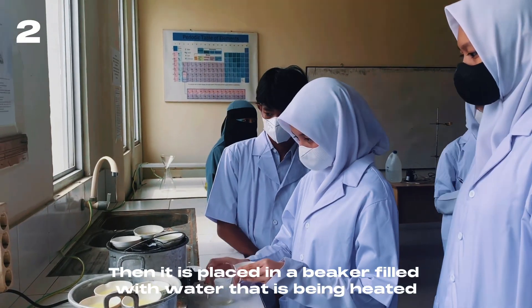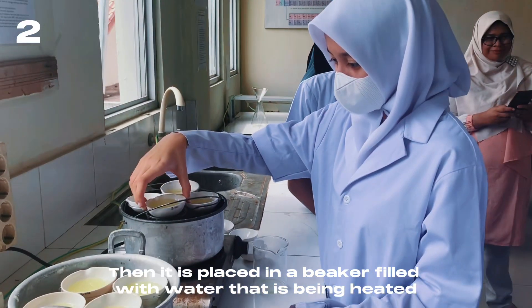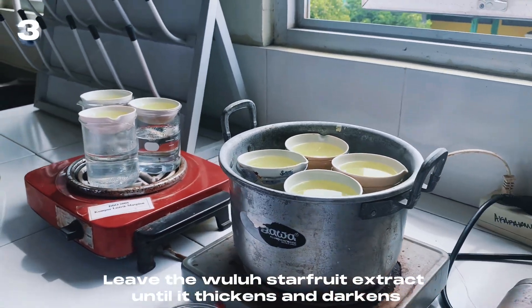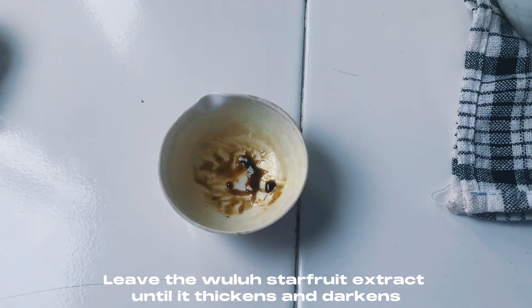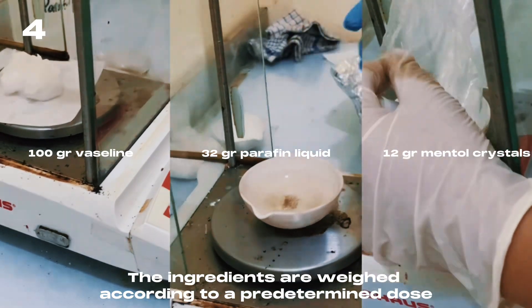The extract is placed in a beaker filled with water that is being heated. It is left until the star fruit extract thickens and darkens. The ingredients are then weighed according to a predetermined dose.